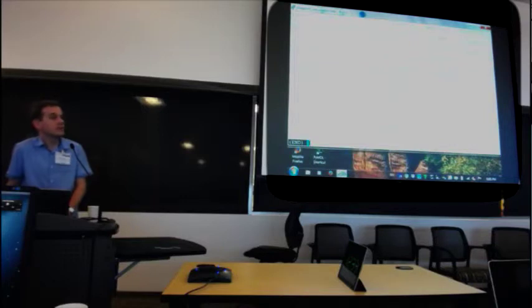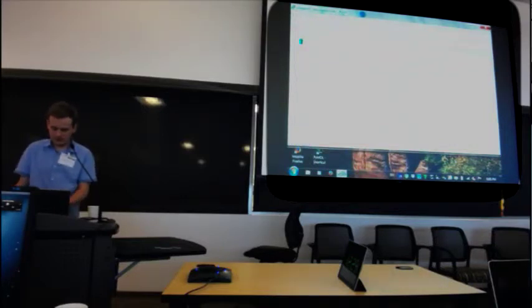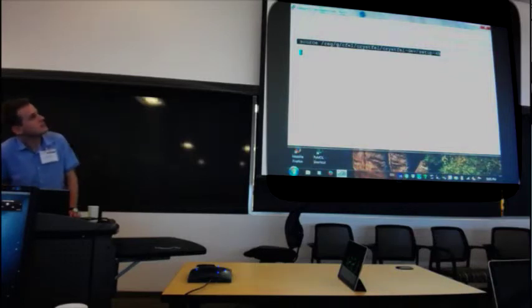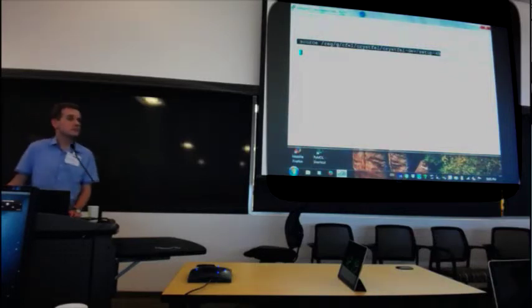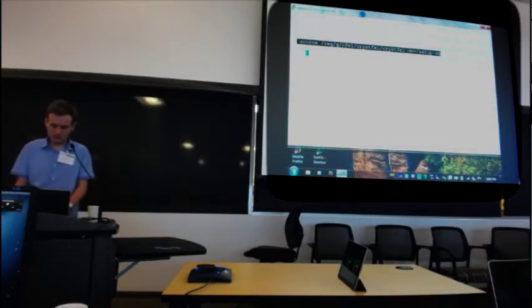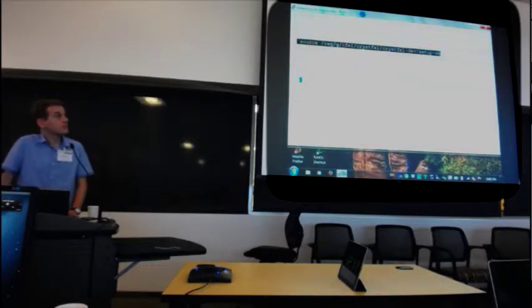But we are using the bash, so we. What's the source command for CrystFEL? Yeah, the source command for CrystFEL is this one. I think you are using the C shell, so you should actually be using the setup.csh. And with bash, that's the one with the dot.